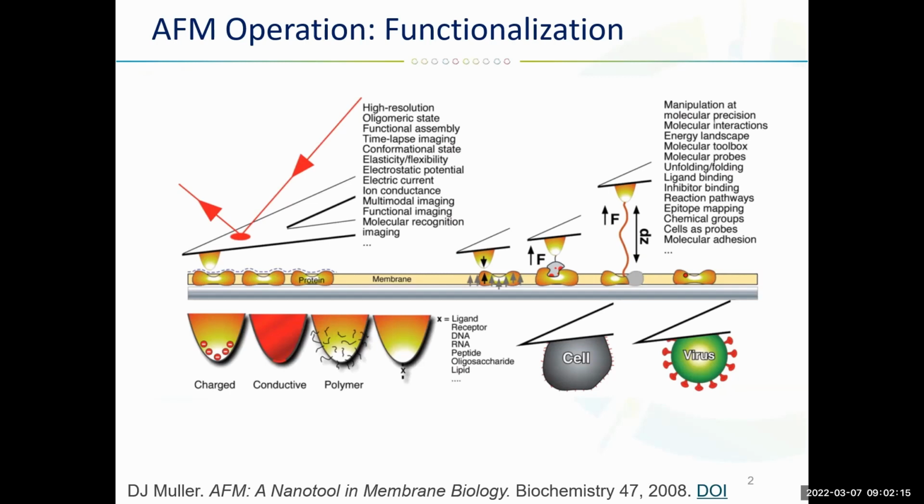So what kind of tools can be provided by AFM? This is a scanning probe technique, right? So it gives us quite unique possibilities for characterization of cells and cell machineries. Here we can use the AFM probe to contour. There is a dashed line, and this line is contouring basically the topography of biological membranes, and we can do this under physiological conditions. The resolution can be sufficiently high to show us separate membranes and individual membrane proteins.